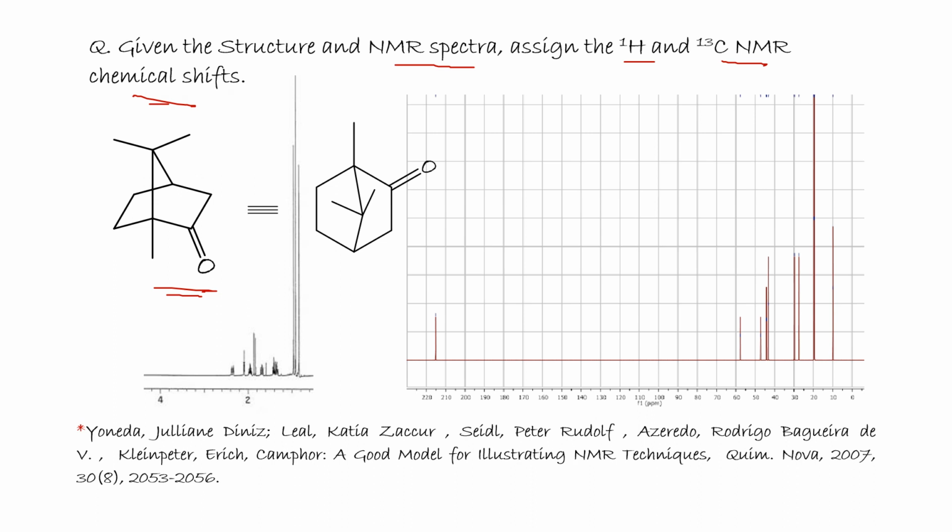This was published in Quimica Nova 2007, volume 30, page 2053. Camphor is a good model for illustrating NMR techniques. Well, we need to assign the signals.